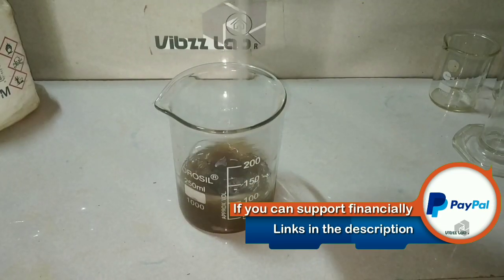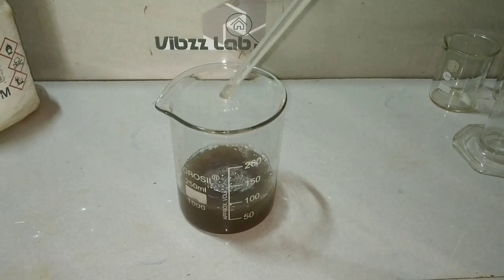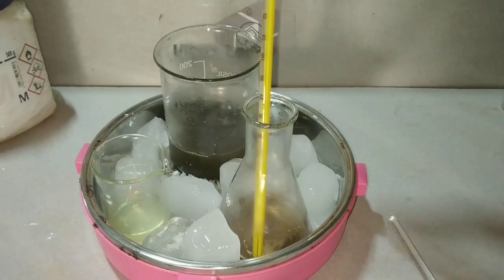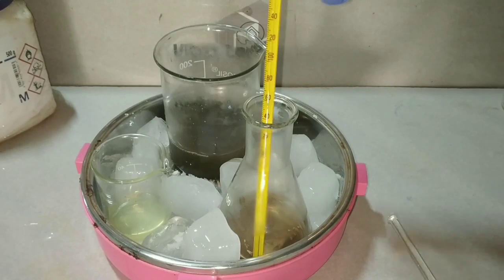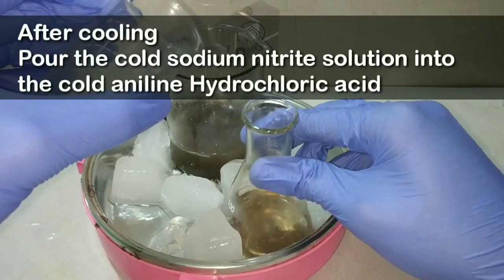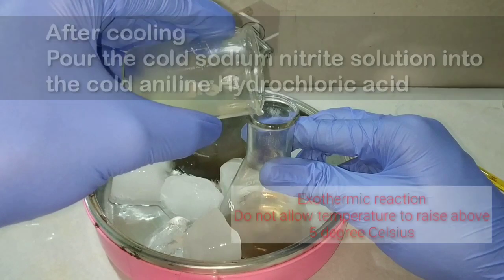This is the ice bath where I have kept all three mixtures to bring the temperature to 0 to 5 degrees Celsius. Record the temperature with a thermometer and make sure it is within the 0 to 5 degree limit before starting the reaction.